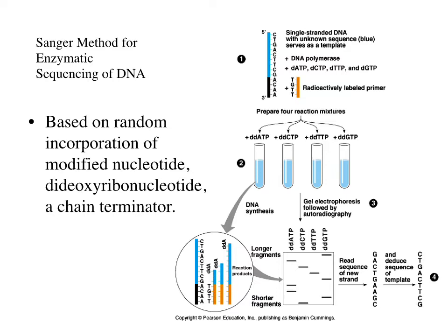These chain-terminating nucleotides lack the OH group required for the formation of the phosphodiester bond between 2 nucleotides, causing DNA polymerase to cease extension of DNA when a modified ddNTP is incorporated. The ddNTPs may be radioactively or fluorescently labeled for detection in automated sequencing machines.